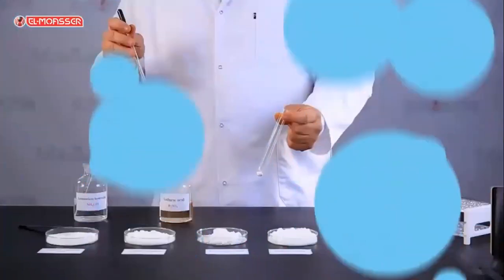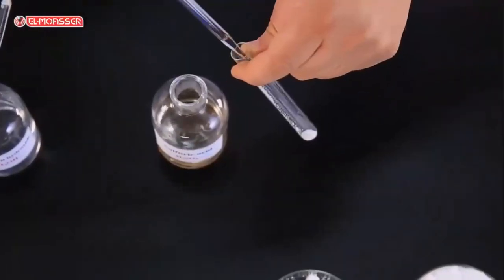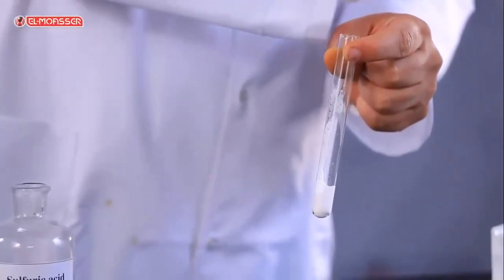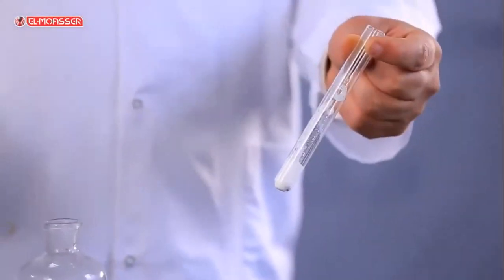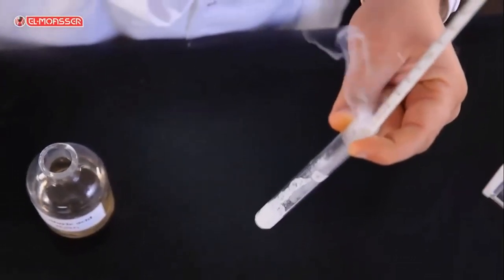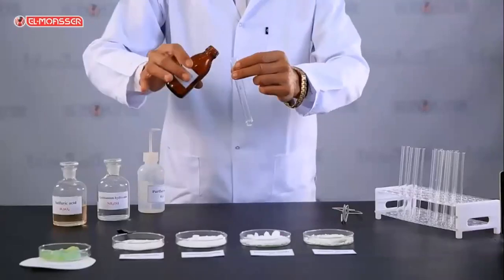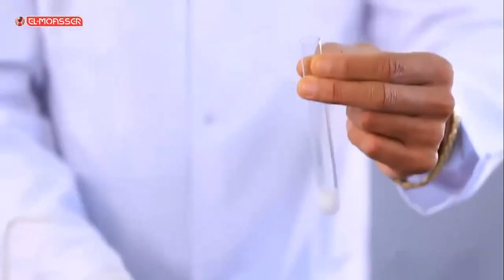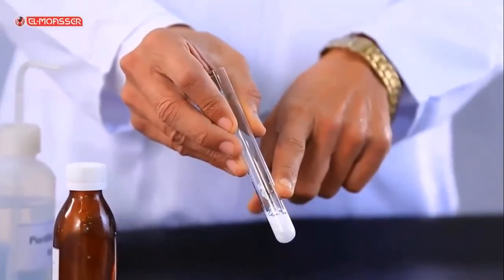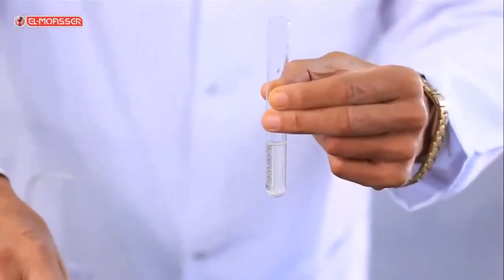Summary. On adding the concentrated sulfuric acid to sodium chloride salt, a colorless hydrogen chloride gas evolves, which gives white fumes with a glass rod wetted with ammonia solution. On adding silver nitrate solution to sodium chloride solution, a white precipitate of silver chloride is formed, which dissolves in a concentrated ammonia solution.